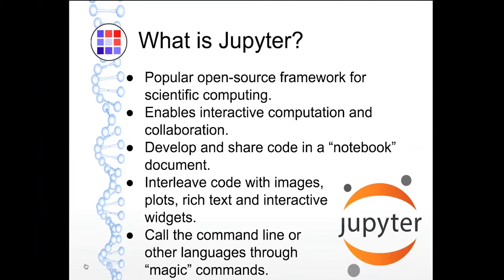And what's more, the HCA Notebook Workspace makes it easy to share this document with your collaborators or to make it publicly available to accompany a publication. Finally, Jupyter has a rich ecosystem of features and integrations, such as the ability to embed images and interactive widgets, and the ability to call the command line or other programmatic languages from a notebook. And these I will go over in more detail later.